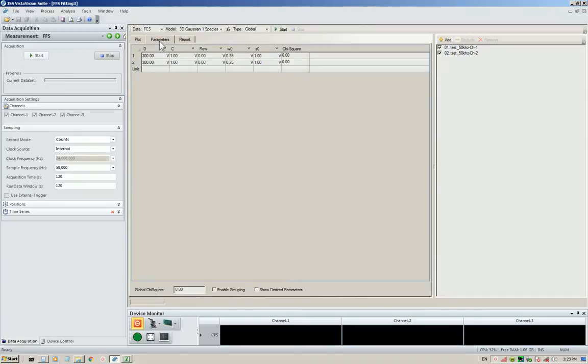Double-click on Link and assign the row range. The linked fields of the rows will change together. Change Z0 value to 0.5 and check the box to fix.